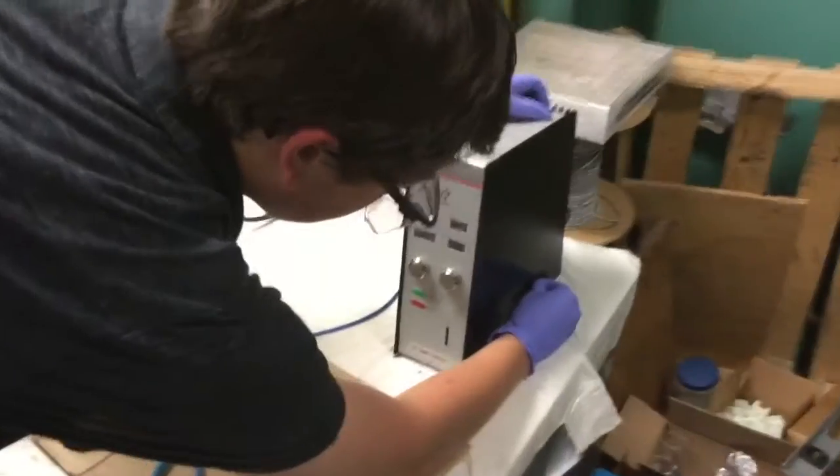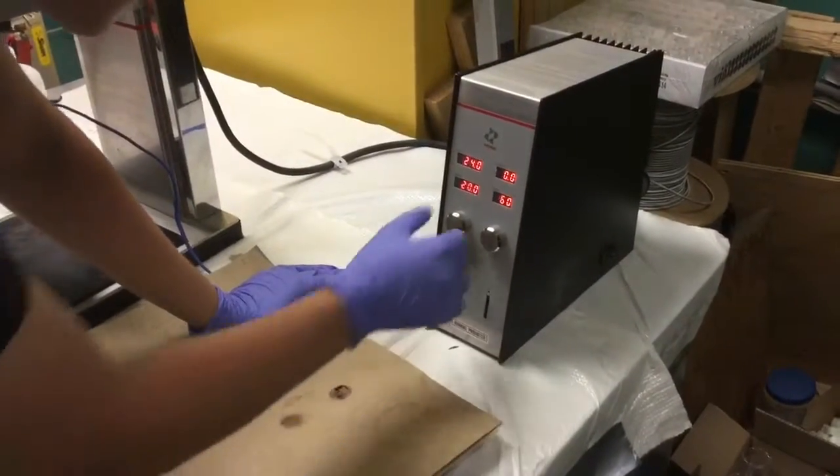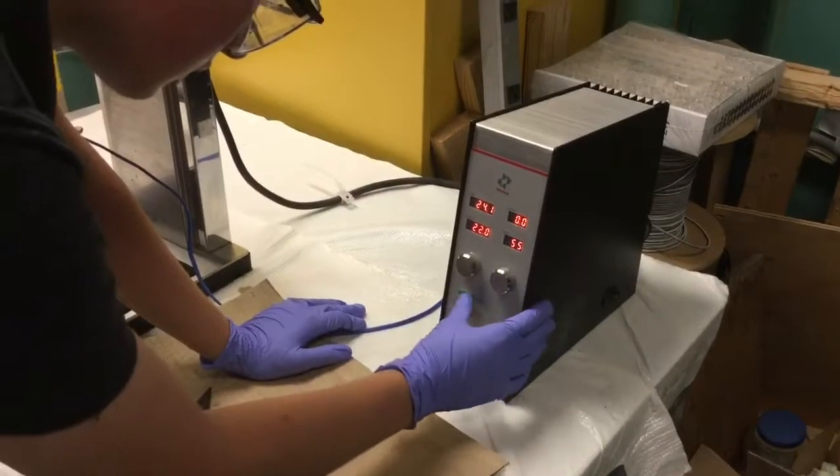Turn on the nanomixer control box using the switch on the right side. The left dial controls turbine speed. The right dial controls the time in seconds. The upper left display gives the temperature of the solution.